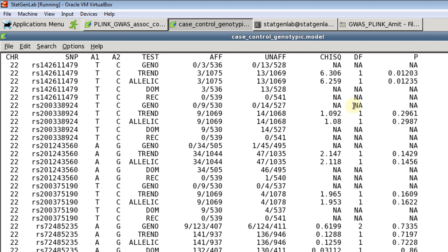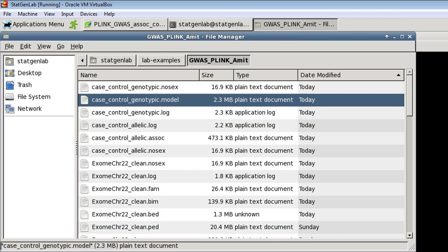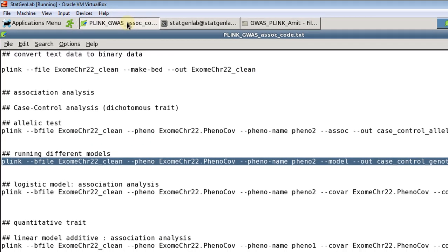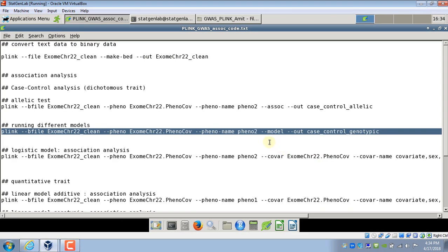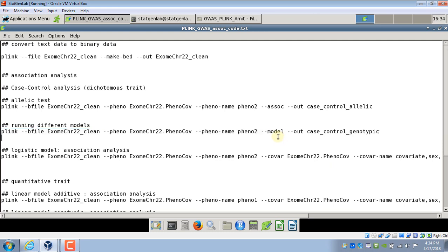So this option is really helpful if you are not sure about what the underlying model is and you want to try different tests. This one option will perform all the tests for you. Of course you will have to correct for the extra test you have performed.